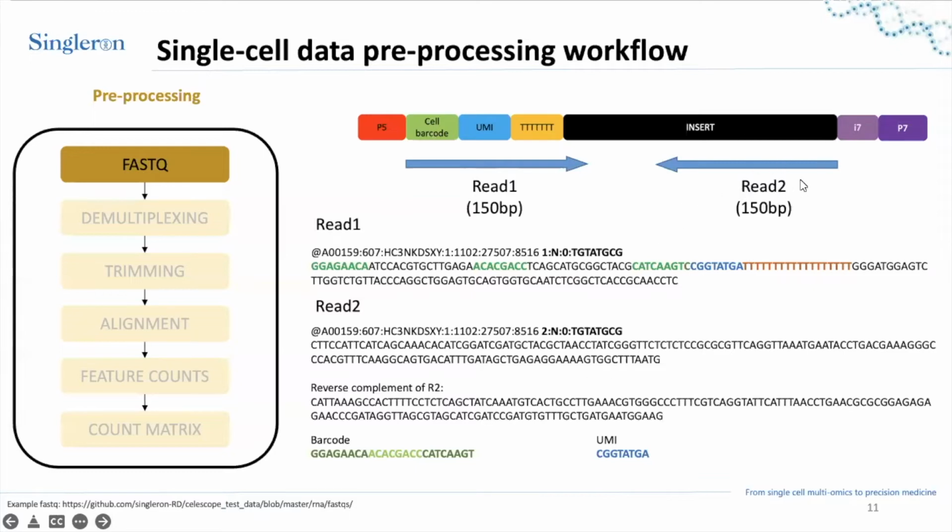So for now, for this one specifically speaking, this fragment is long. So the read 1 and the read 2 don't overlap. In some locations, we do observe the read 1 and the read 2 can overlap, but for this one, it doesn't. And then the sequences that we are really interested to count are the sequences from read 2, actually, because the read 2 represents the insert sequences. And then this is the read that we actually map to the genes or the genomes later.